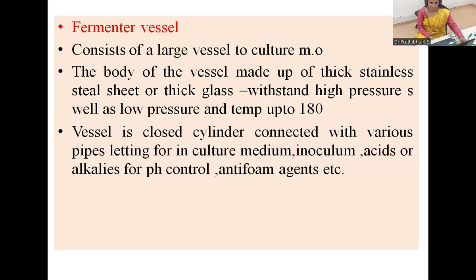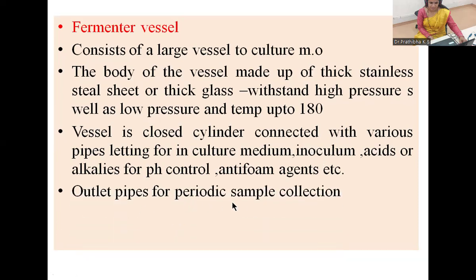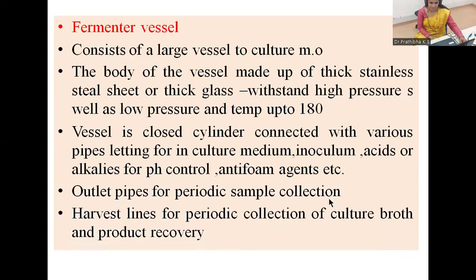Temperature up to 180 degrees Celsius. And usually this fermenter vessel is a closed cylinder connected with various pipes, letting in culture medium, inoculum, then acids or alkalis for the pH control, and also antifoam agents and so on. Inoculum means nothing but the microorganism. Outlet pipes for periodical sample collection will also be there at the bottom of the fermenter vessel.